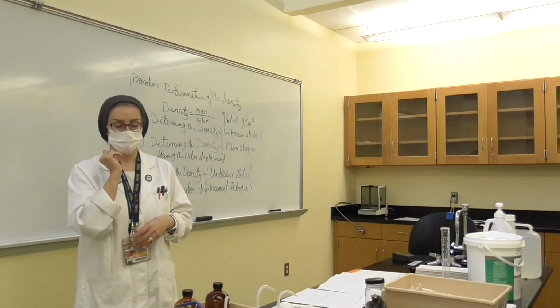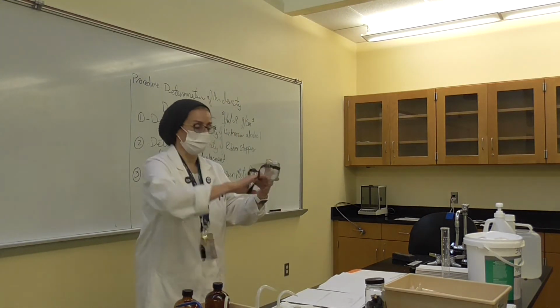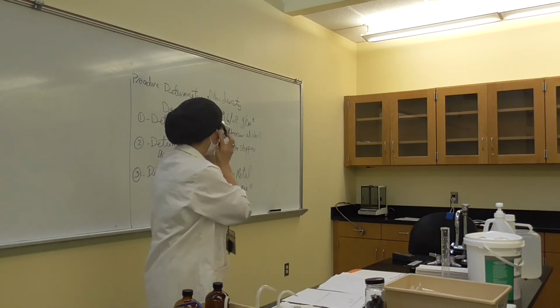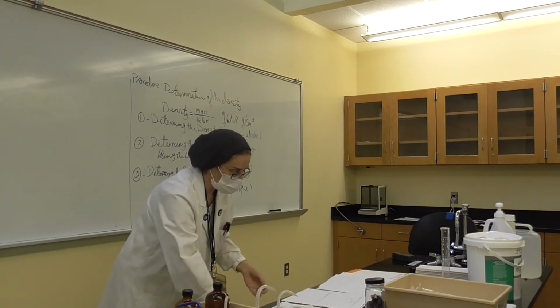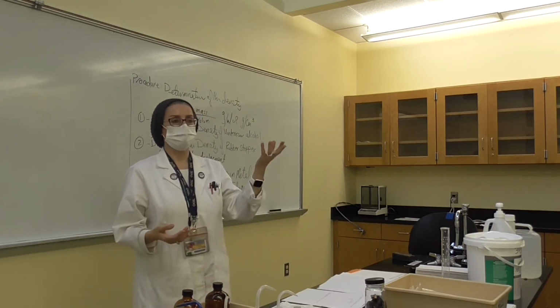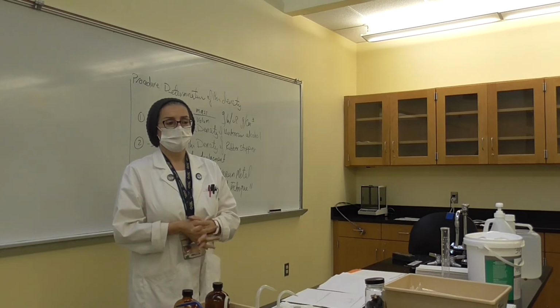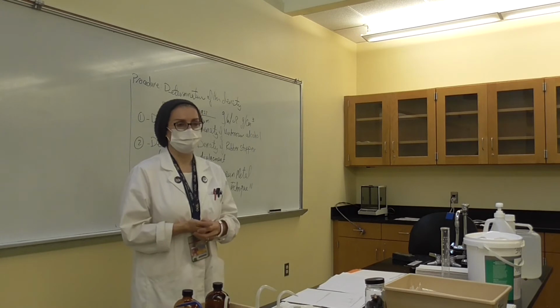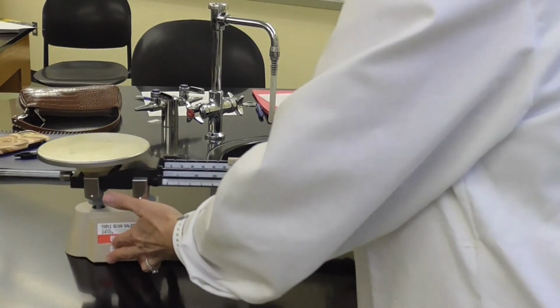Your own goggles. And it has to be one of those, as I showed you here, this one. It has to cover all your face. And these are cheaper than the others. And again, as I said probably before, Lowe's will sell it for $2. Home Depot will sell it for $5. I don't know why it's more expensive. But anyway, is everybody with me here?